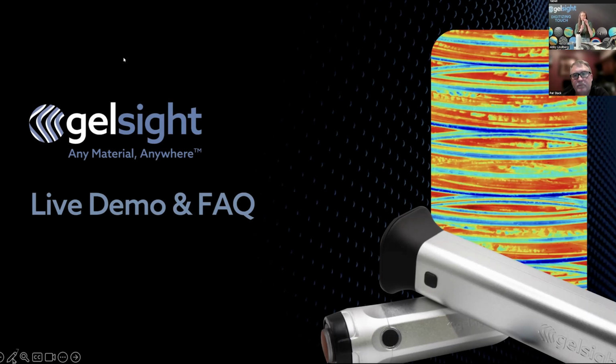We've got about a 3 millimeter thick gel here, so the gel has to make contact to make a measurement, right? And then the aspect ratio of the surface of your part matters. If you're looking at a really narrow crack that's really deep, the gel might not make it to the bottom of that. So we do typically look for that 1-to-1 aspect ratio to be able to reach the bottom of a feature.